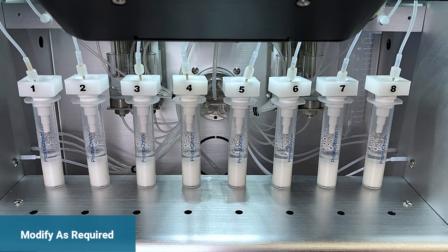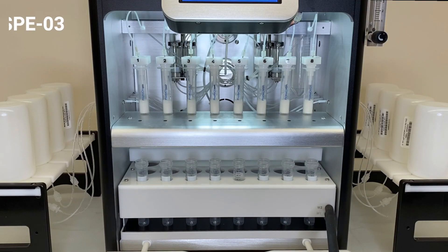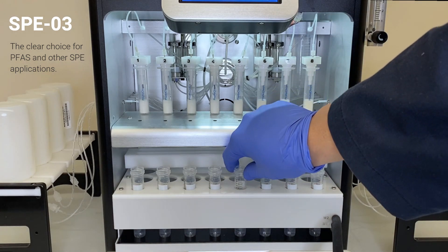You may change the cleaning steps depending on your application. The full automation, ease of use, and superb results make the SPE03 a clear choice for government, commercial, and research labs doing PFAS and other compounds.